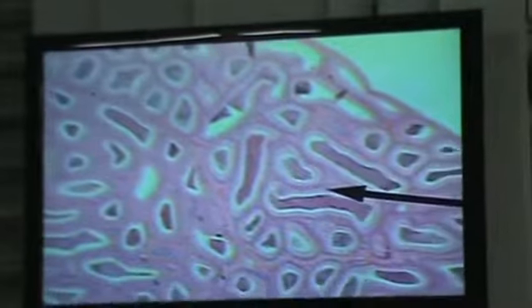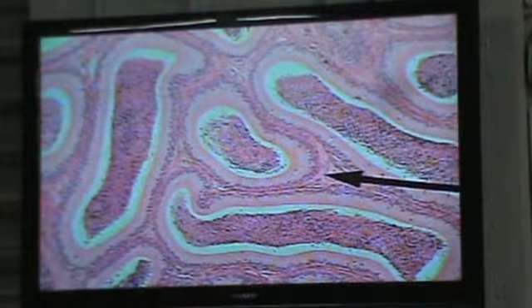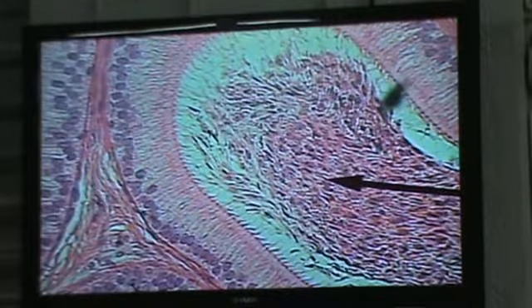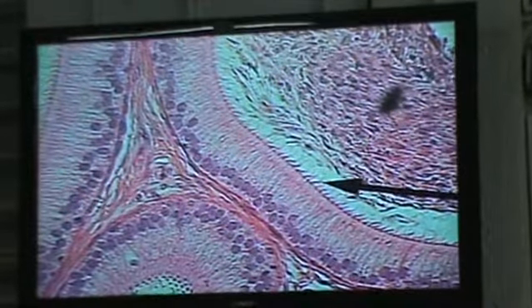Okay, wow, look at that. So there's a lot of storage right over here. Very good. Okay, so this is much better now. The stereocilia there are far more prominent right here.